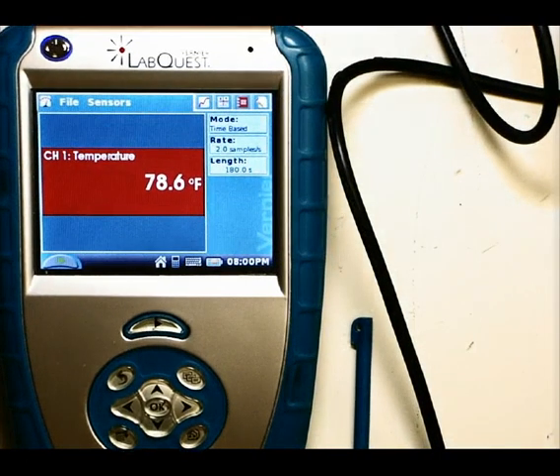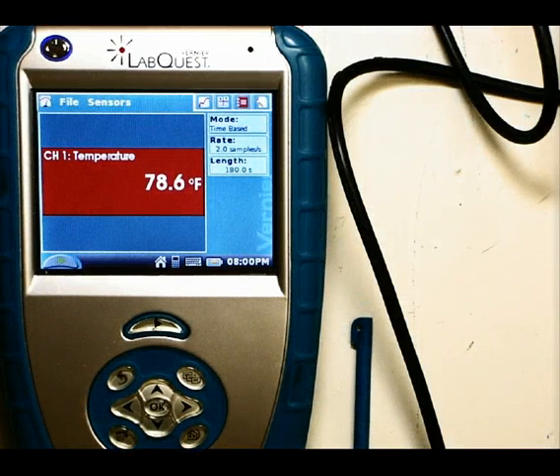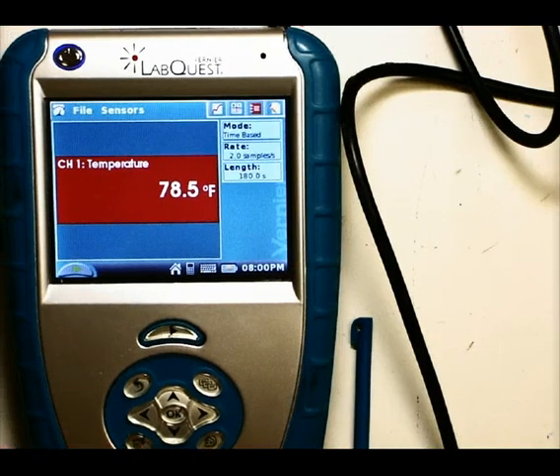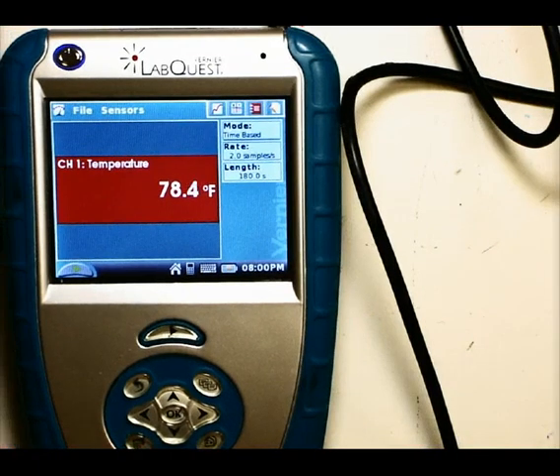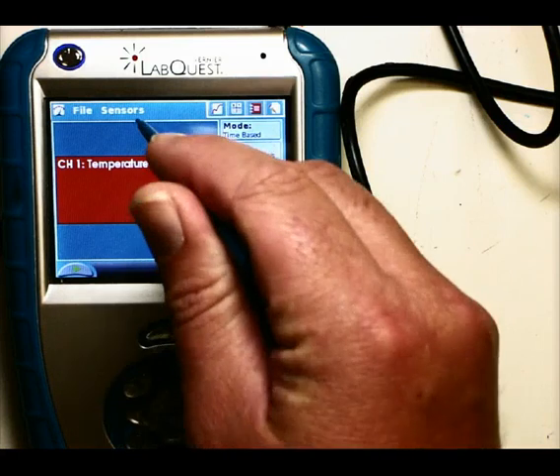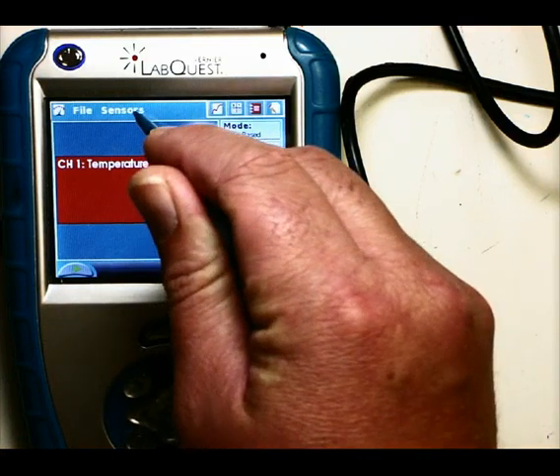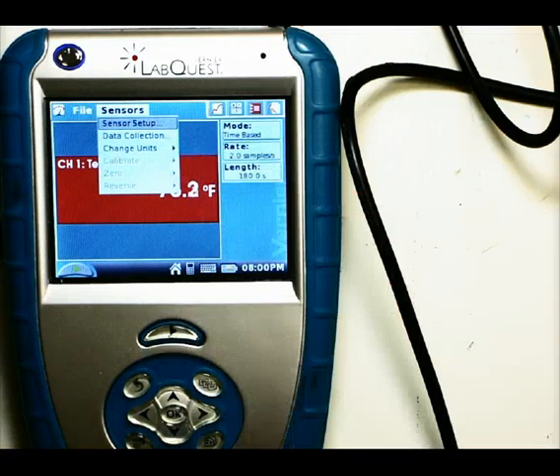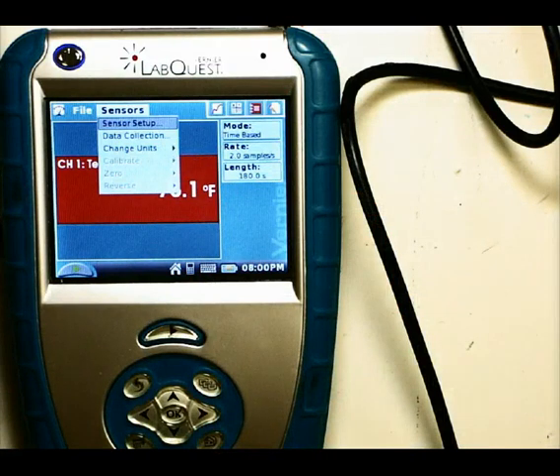I'm going to zoom in as much as I can. What I'm going to do now is set this up to take the temperature for whatever settings I want. There are a couple ways to get into this. You can click on the sensor menu and then go to data collection, which is going to give you options about how you want to set this up.